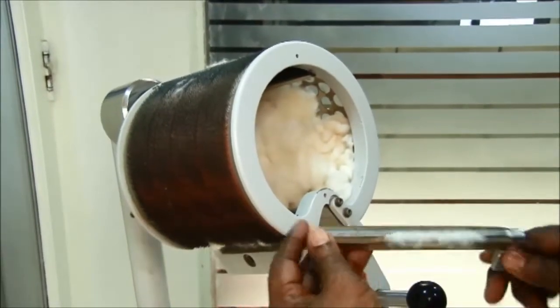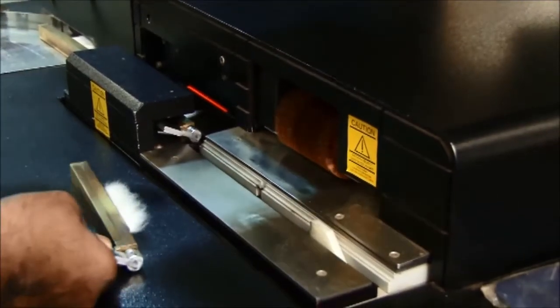For the micronaire module, a predetermined mass of raw cotton is placed in a measurement space and compressed.